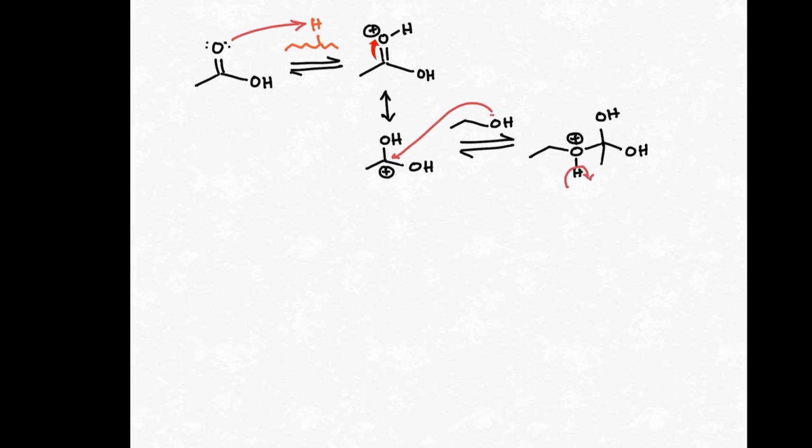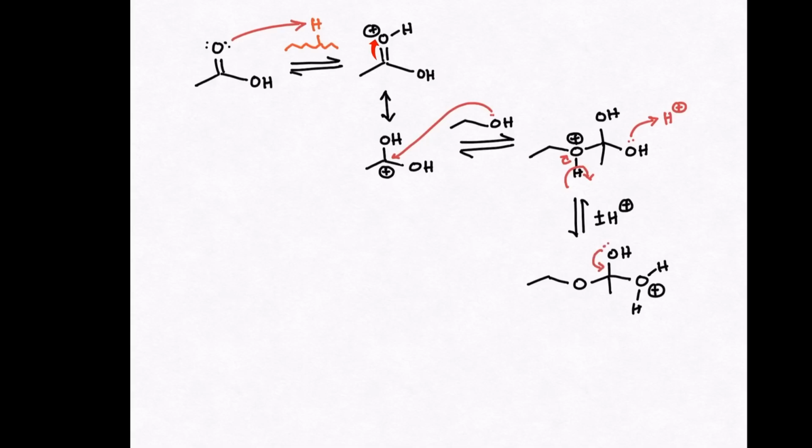Next, the proton is transferred and water is released. Finally, it is deprotonated and the final product is formed.